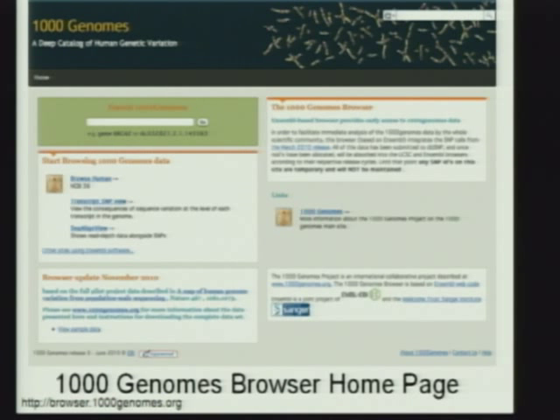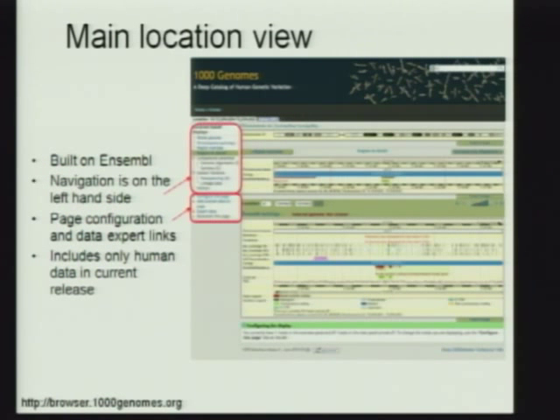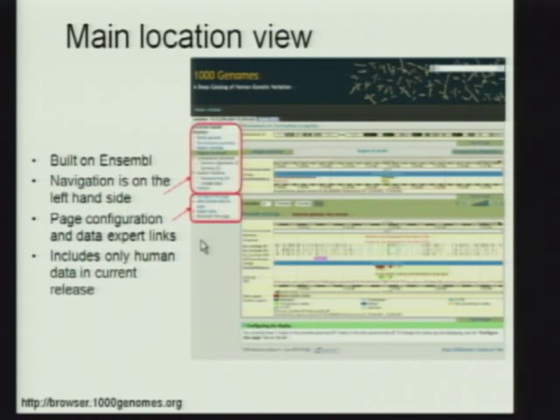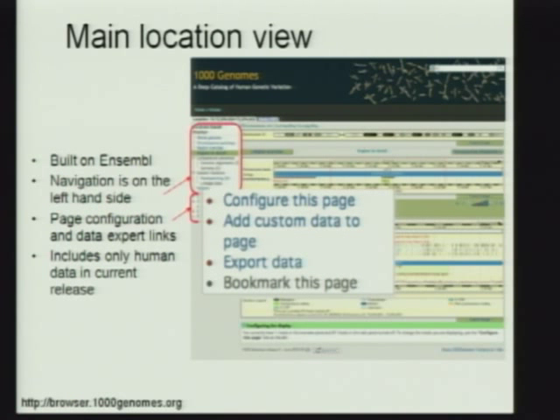This is the most recent version of the browser — we actually just updated it today. The main location view of the browser is built on Ensembl. There's navigation on this side where you have regions of the genome and chromosome summaries. There's a link for resequencing — I'll get back to that in a second — where we have information about each of the individuals in the high-coverage trio. Lower down there are aspects of page configuration. The key link here is 'Configure This Page,' which changes what you're looking at, changes which tracks are available, as well as export data, which I'll come back to in a few minutes.